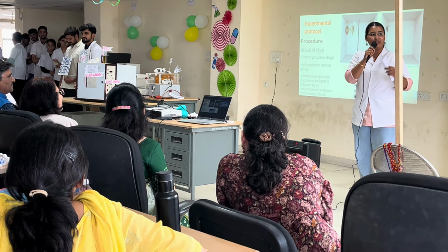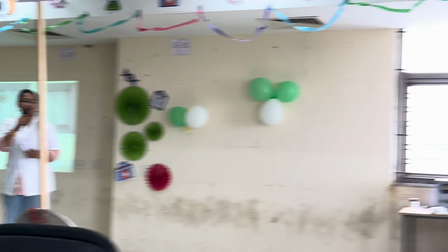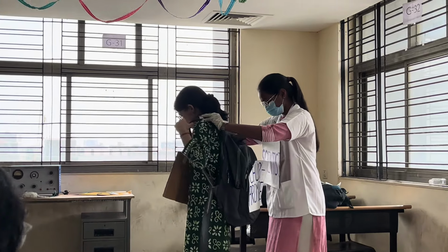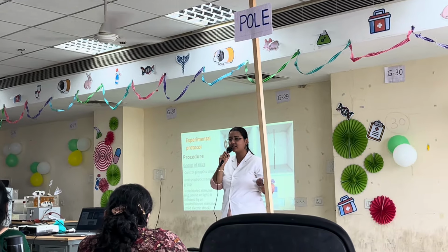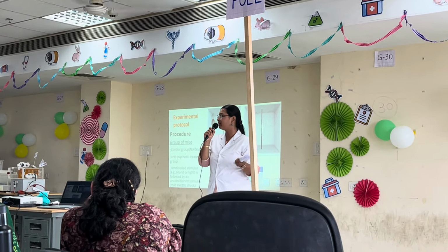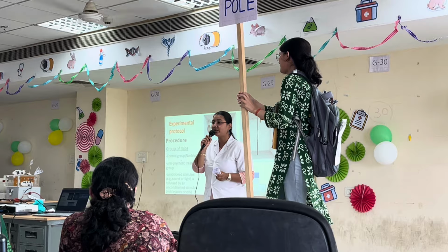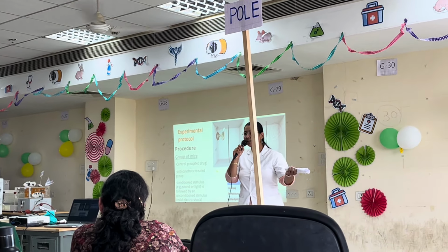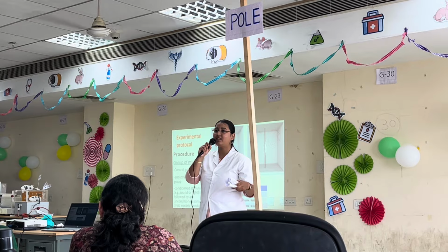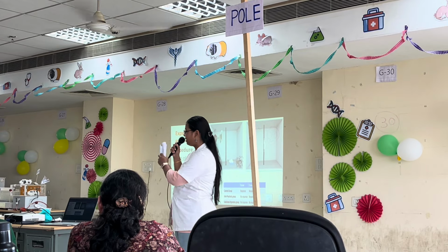Our next case is when the mouse is administered an antipsychotic drug, which is chlorpromazine. And the experiment begins. When only the buzzer is played, there is no response. Yes, so there was a positive response when the mouse sensed the current. Now, any guesses why the mouse climbed when there was a current and didn't climb when there was only the buzzer? The reason will also be explained by a live demonstration.